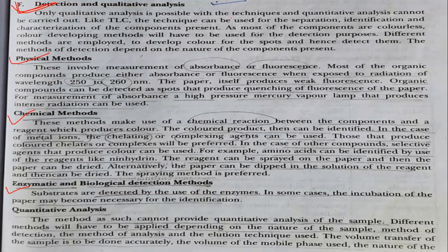In the physical method you can study the absorbance, then you can study the fluorescence, after separation of the components from the sample. The wavelength used may be 250 to 260 nanometer. You can see the fluorescent light which you observe on the paper, and that will indicate whether the components are separated or not on the paper. That is very easily observable. For that purpose we use a high pressure mercury vapor lamp.